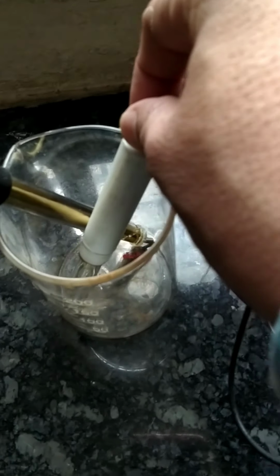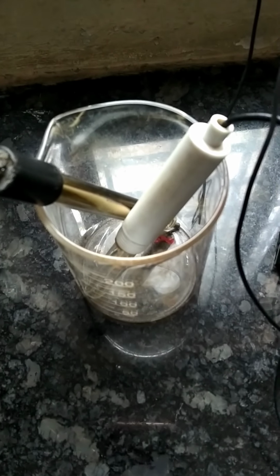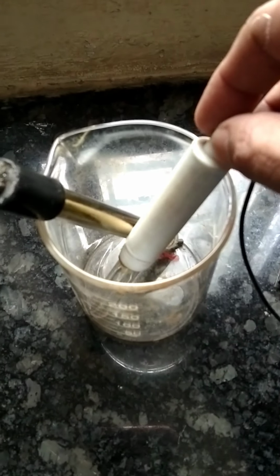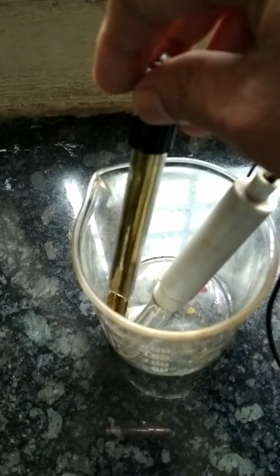Another type of instrument is there. It is a pH meter and it is an electronic device which contains a Wheatstone's meter bridge. It records pH of the solutions when attached to the glass electrode. These are the types of electrodes used in the determination of pH and conductivity of the solution. Conductance is also important because conductance is the amount of current carried by the ions in the solutions. So in inorganic experiments that can be determined using this type of electrode.